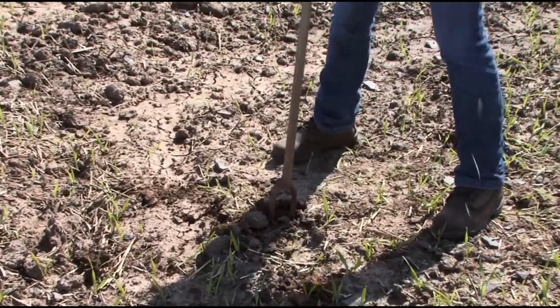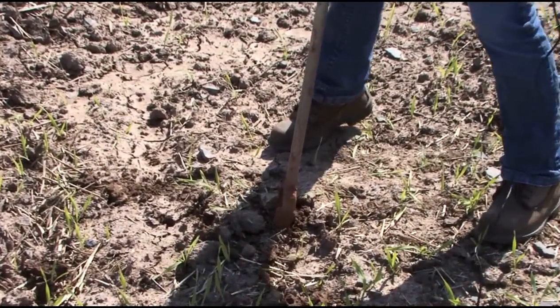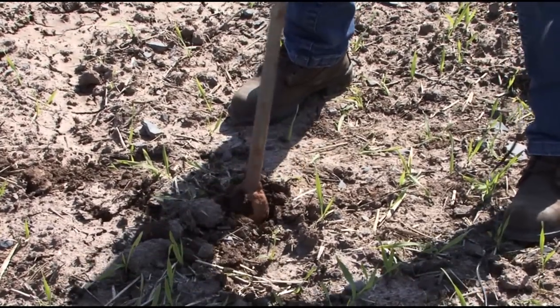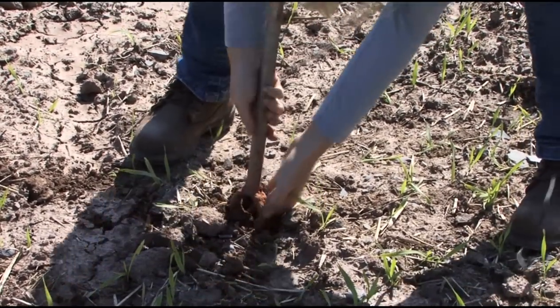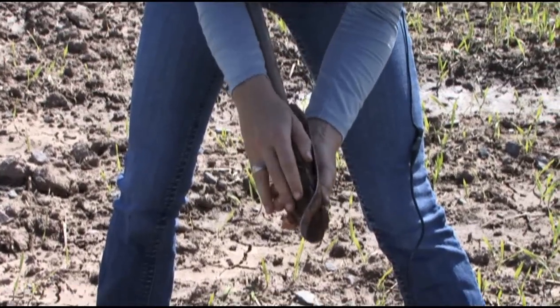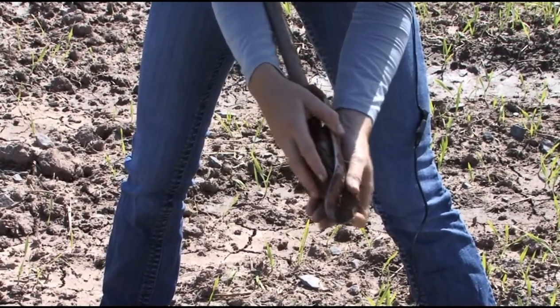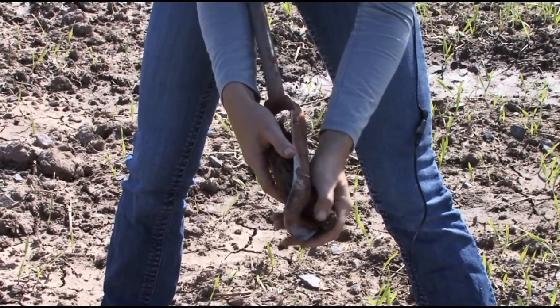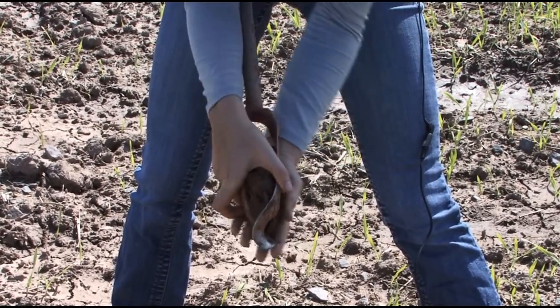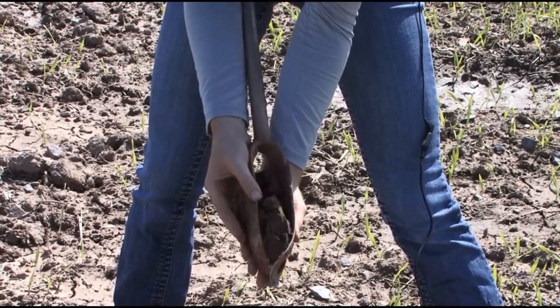And you just auger down. You can see this ground's actually a little harder to go through as well. When you pull the auger up, you'll get your sample there. With the Dutch augers, it's a little harder to get a nice uniform sample. But if your ground's really tough to sample, sometimes this is the thing that'll do the trick. And there's your sample.